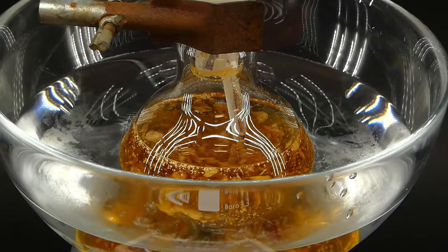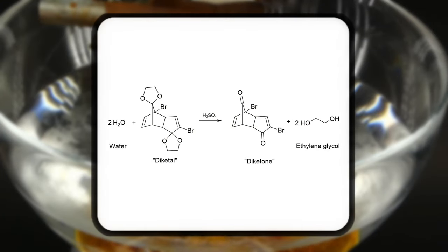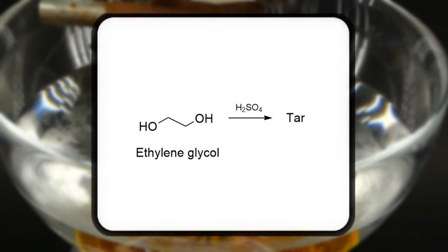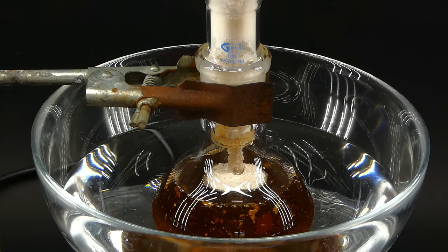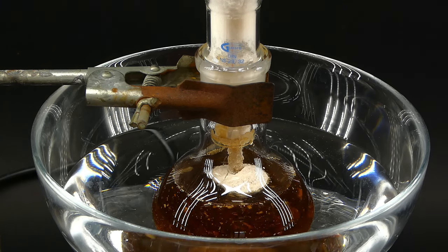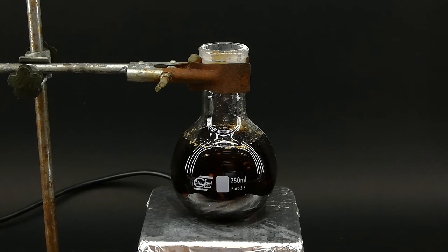The diketal is slowly getting ripped apart by the sulfuric acid into the diketone and ethylene glycol, which then makes the whole thing become tar. When I finished adding all the diketal, I removed the ice bath and left this thing to react for the night.